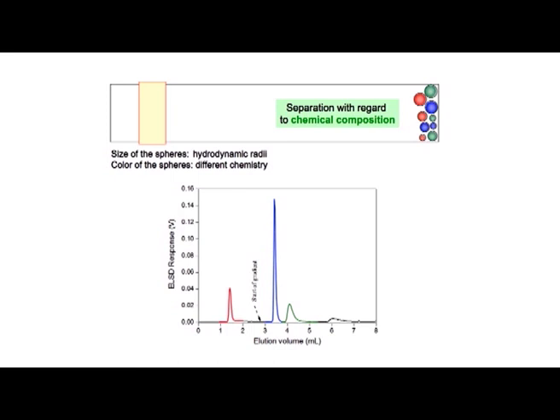So, as you can see in the chromatogram, we have a nice blue peak there, separated from another component that is in green color. So, we got an efficient and fast separation. As you can see from the time scale, it takes only a few minutes to separate the mixture into its individual components. Nowadays many analytical labs, research labs, and industries are using this, because even though the instrumental setup is quite costly, it is very fast and efficient.